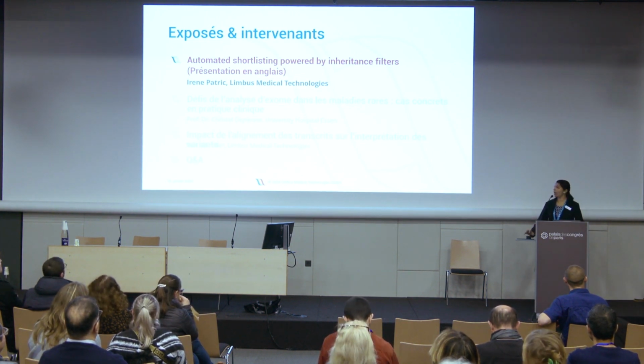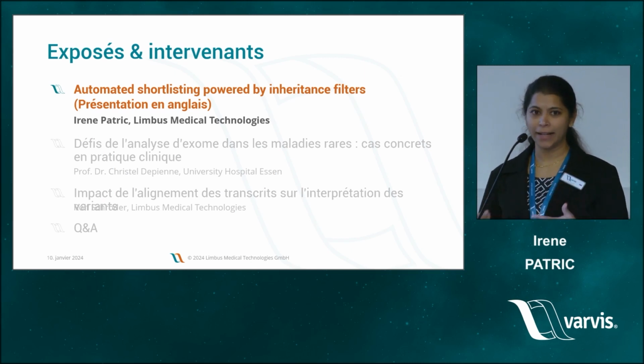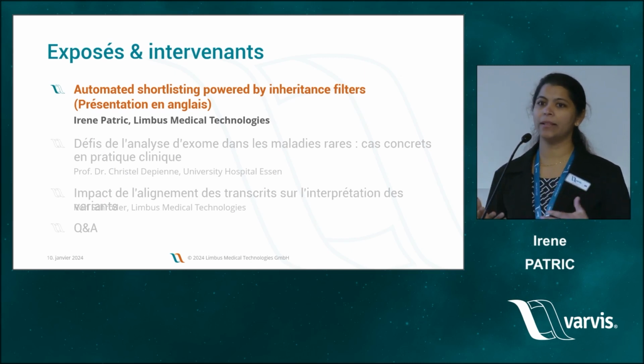And now I will be talking a little bit about how inheritance filters are designed and why scientific designs are important.